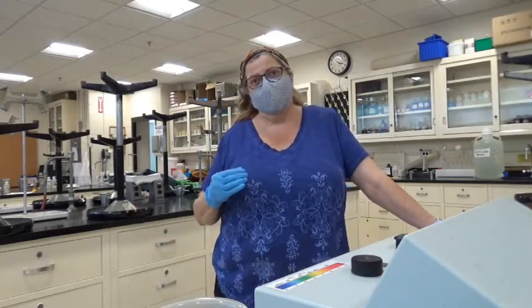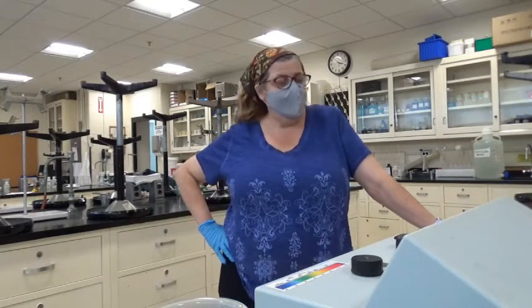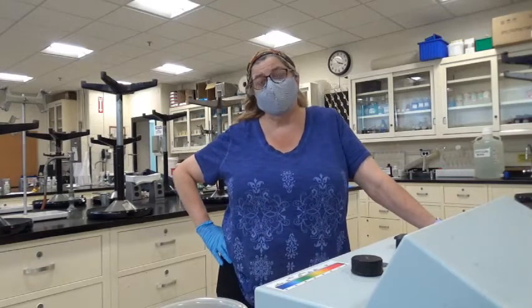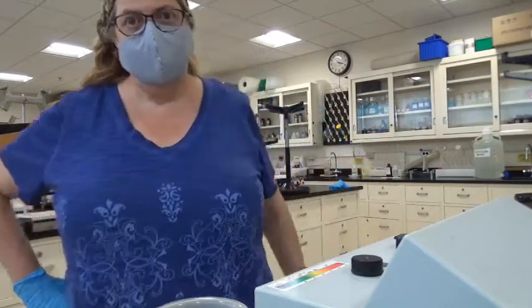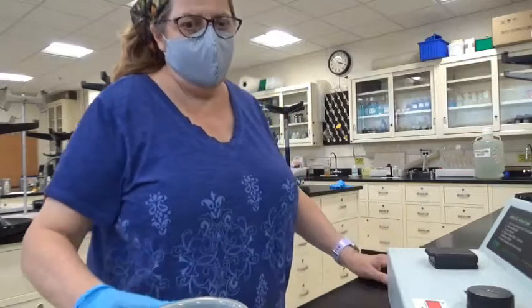And the ammonia complex has a very distinctive absorption at 600 or so nanometers. So we're going to measure the absorbance of both of these solutions at 600 nanometers. So I'm going to use a Spec 20 to do this.